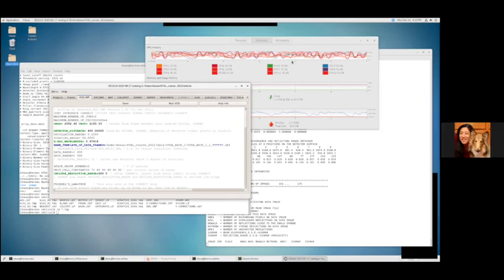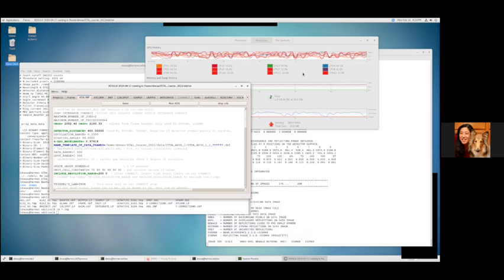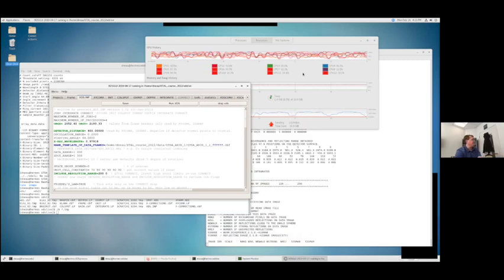If you're crazy and want to run this on your Mac, I would set it to 1 processor, 1 job, start it, and then walk away and come back later. And when she says your Mac, she's talking about your Macintosh laptop. If you have a desktop Mac with quad core processors, then feel free to bump the jobs up. The thing to watch out for is your memory.